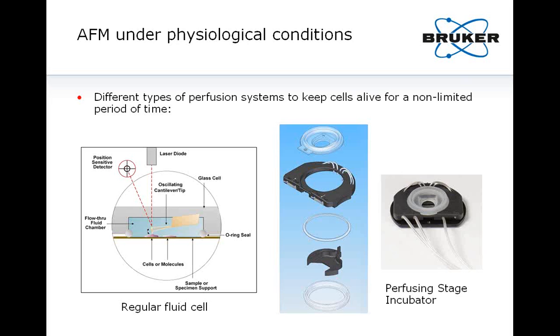On the top of this you have a silicon seal to work in a fully closed environment and of course limit the evaporation. So the purpose of that design is that you can keep cells alive for an unlimited period of time. And actually we carried out some tests and we could keep cells alive for 48 hours.